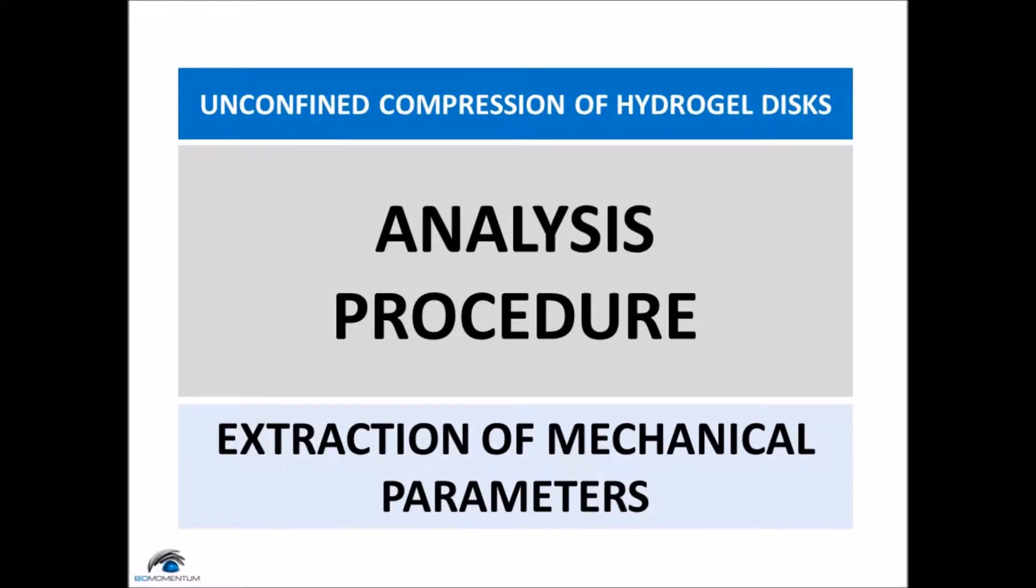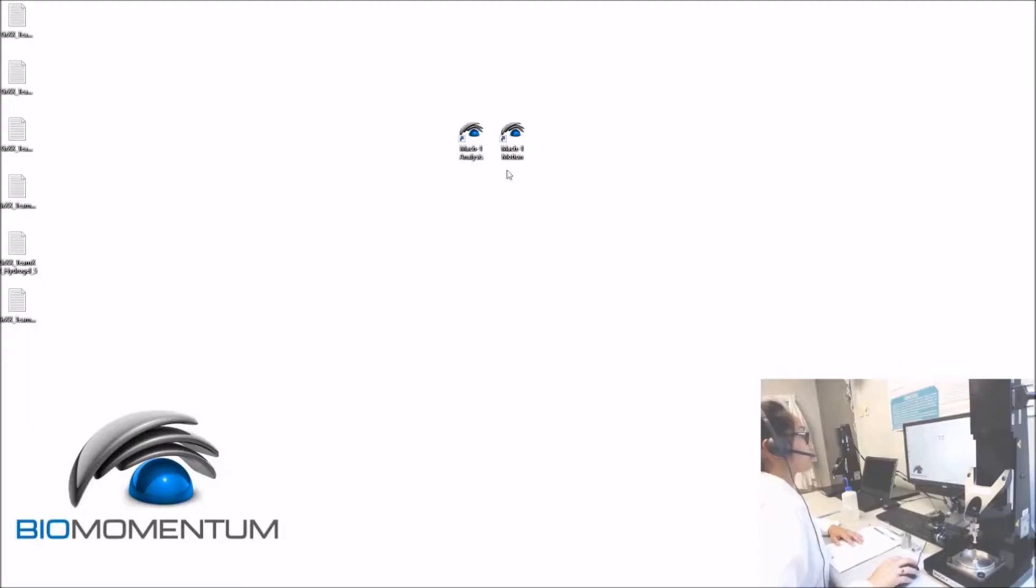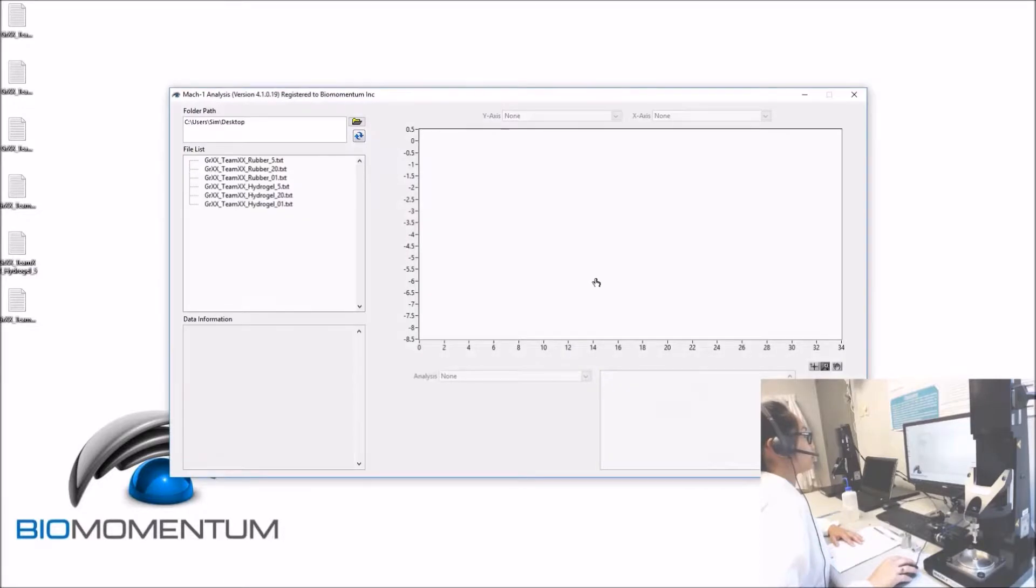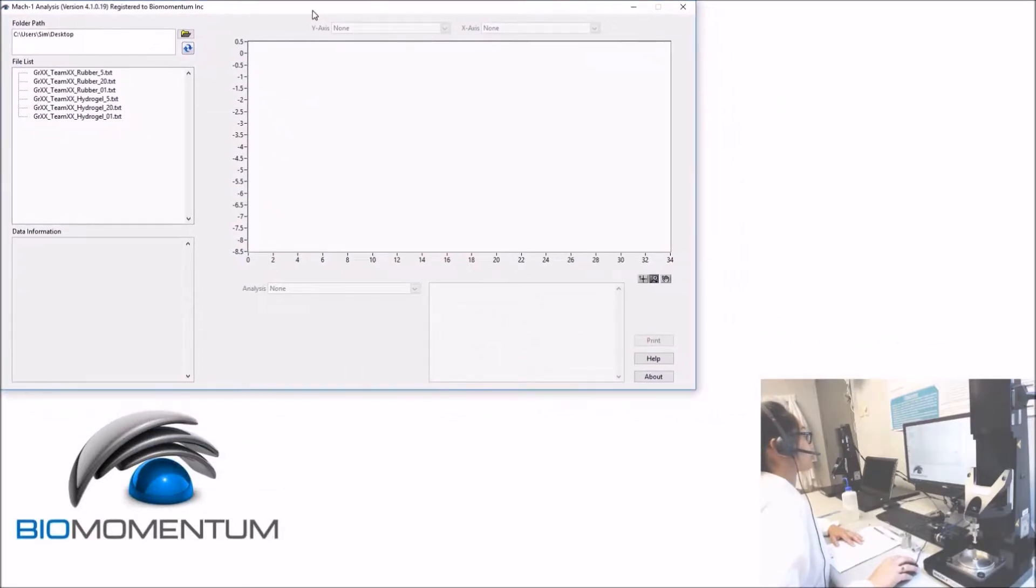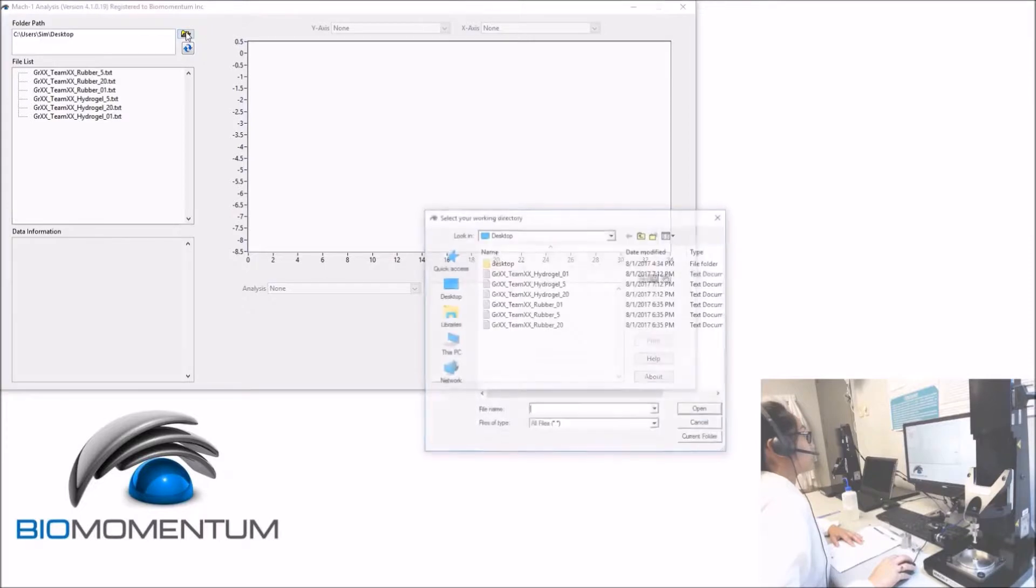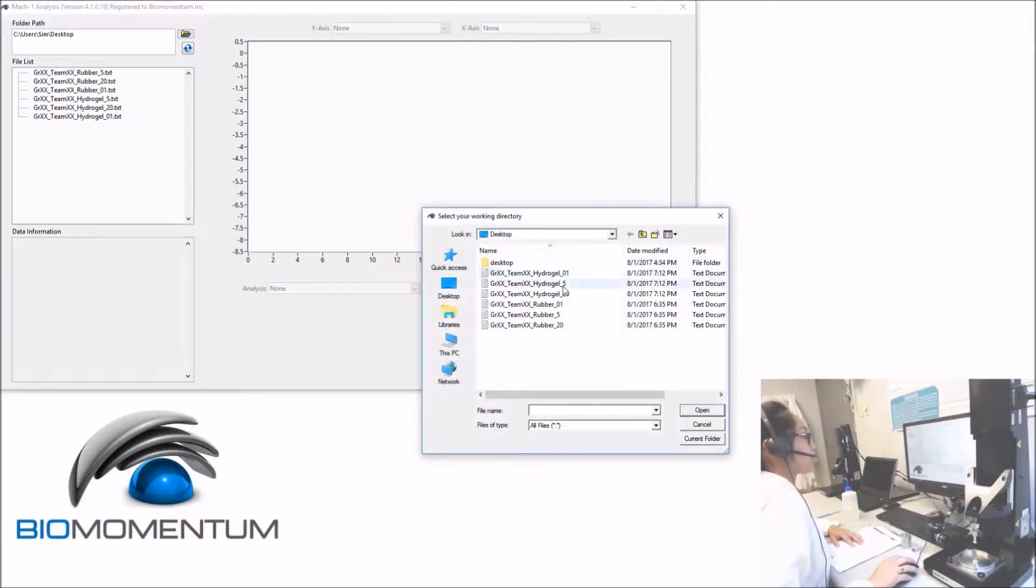And now the analysis procedure. Open MacOne analysis software. Open the folder path containing your results file.